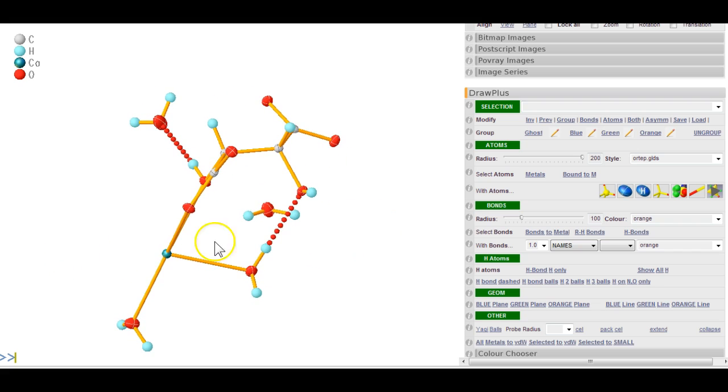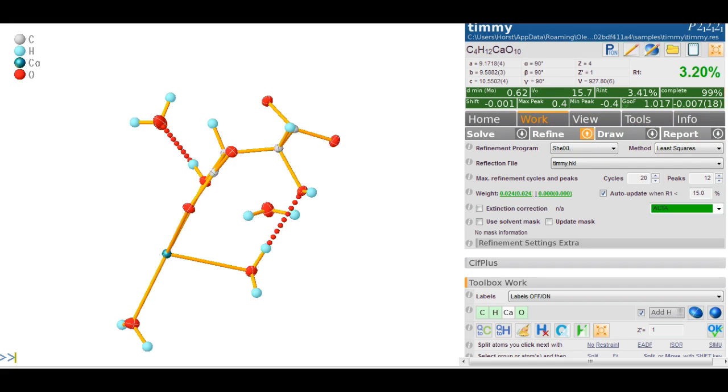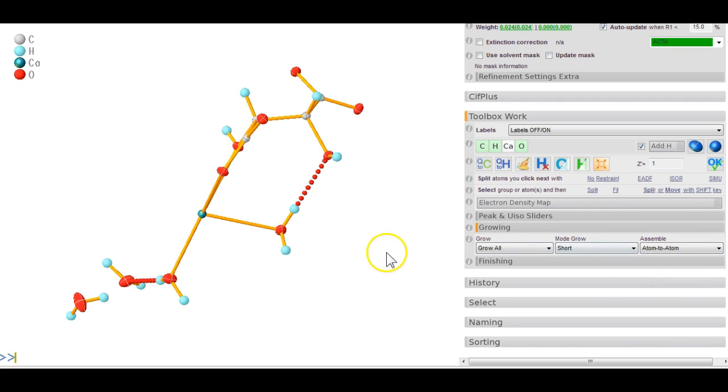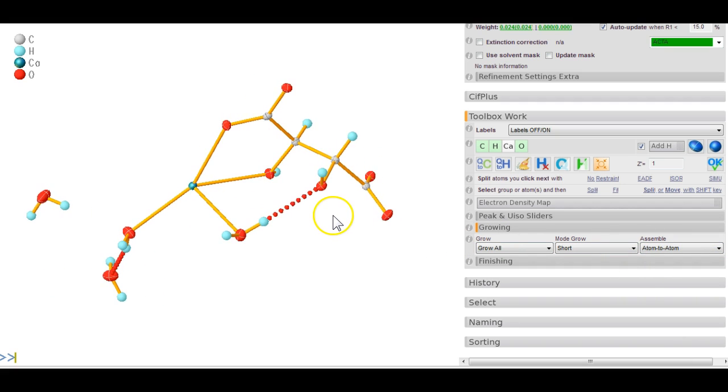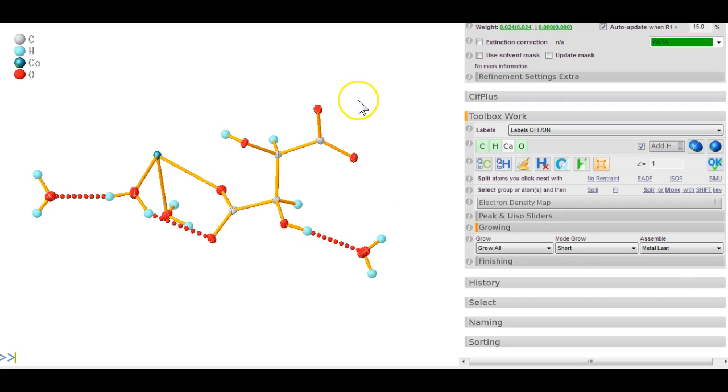The hydrogen bonding submitted in this structure isn't actually ideal. Let's go back to work and refine into the toolbox work. There's different ways of assembling this atom to atom. Metal last gives you a really nice result—now we see three hydrogen bonds all within that asymmetric unit.